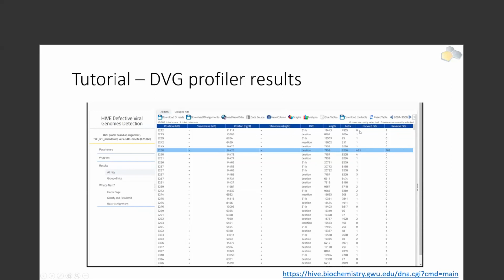And you can see that we report both the forward and the reverse hits as they've been described in the previous chart for the reverse complement junctions. And you can see that there are some cases like this one here, where we do report a lot of hits in this position, but there are neighboring positions that are reporting some of the hits.